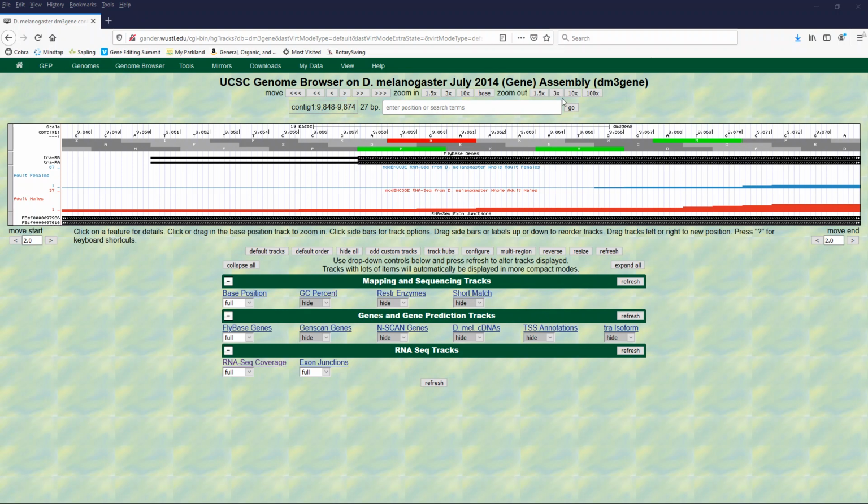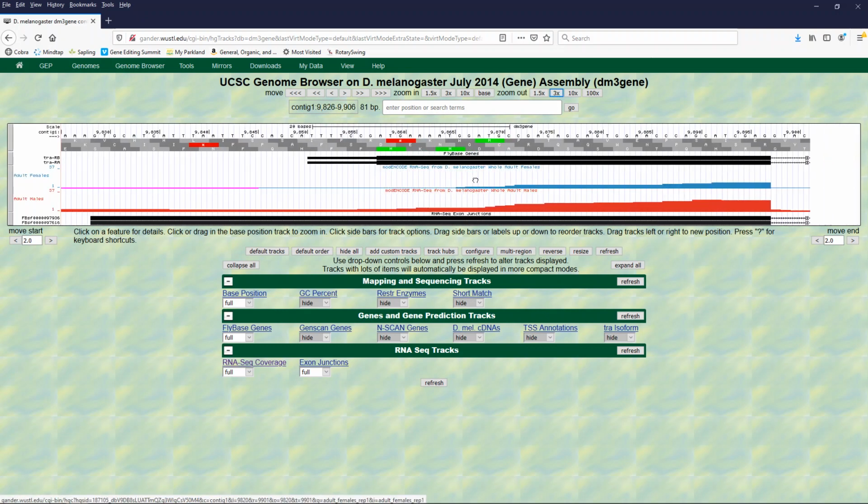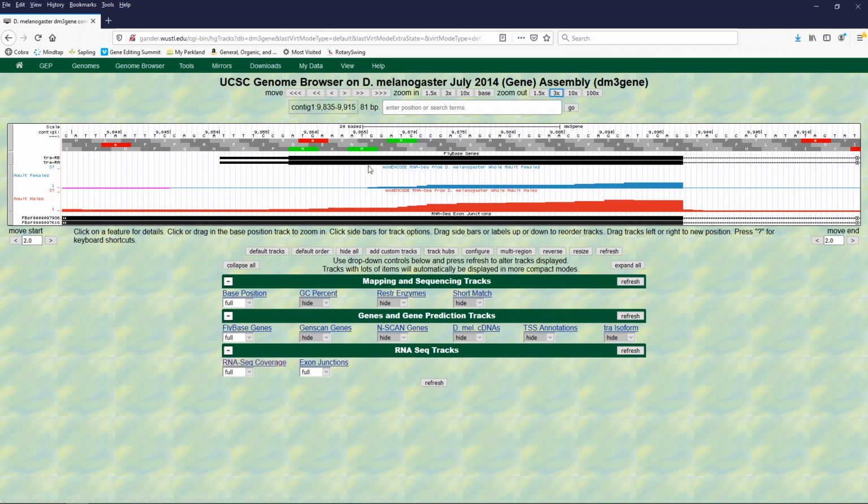So now let's zoom back out. So we're looking at the entire first exon, which you can see here, and we can now read off the amino acid sequence for the first exon: M, K, M, D, A, D, S, S, G, T, Q, H, R. I'm just reading the bottom row here. Okay? So that's going to be the amino acid sequence for the first exon.